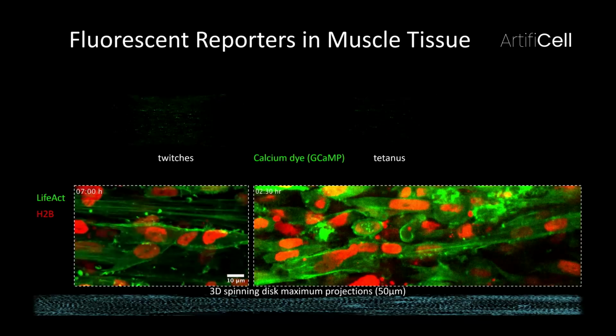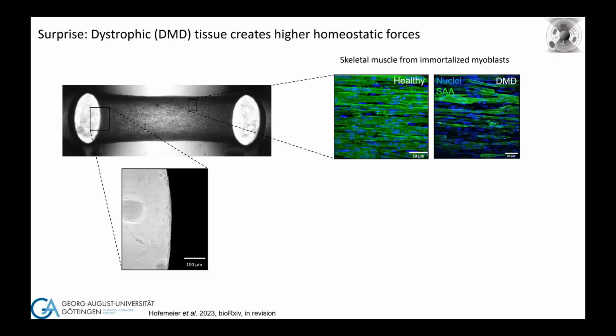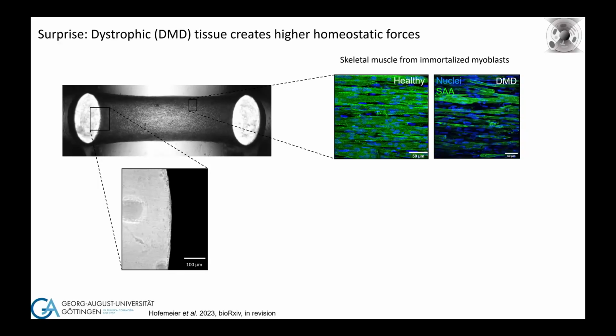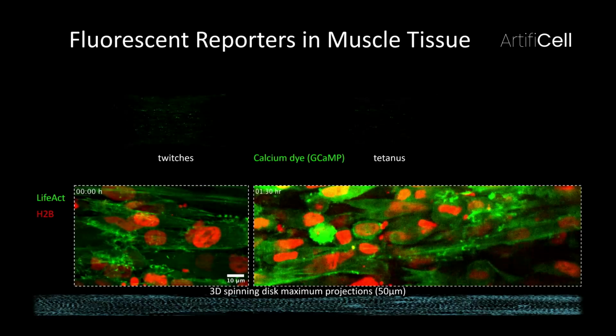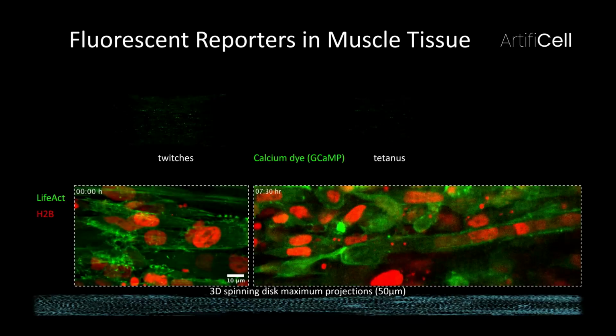What you see over here, that's also kind of neat. You see there's already a myotube because all of these nuclei are going together here. So this is a lot of fun now. And we're really starting to look deeper into this.